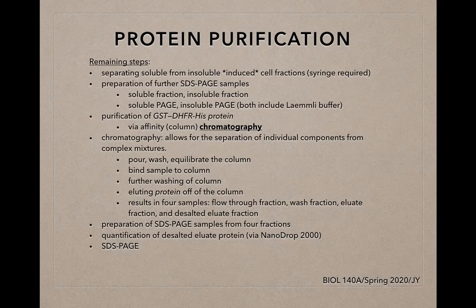Using these 4 fractions, 4 SDS-PAGE samples would be created. That is, flow-through PAGE, wash PAGE, eluate PAGE, and desalted eluate PAGE. Followed by that, students would quantify or determine the concentration of the desalted eluate protein sample. This would be done via NanoDrop 2000 spectrophotometer.